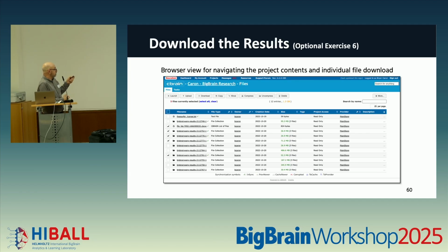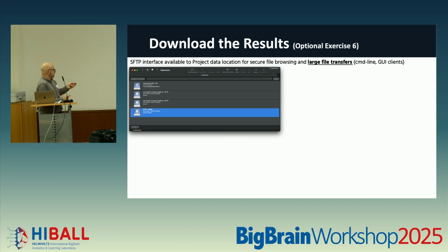In the actual exercises, like I said, that are linked there in the notes off the agenda, we have additional ones that I've had as a last exercise. If you want to navigate the actual contents, you can still do this even though the last exercise didn't go according to plan. You can navigate to the next exercise, number 6, to give you some examples of, for example, how to download files.